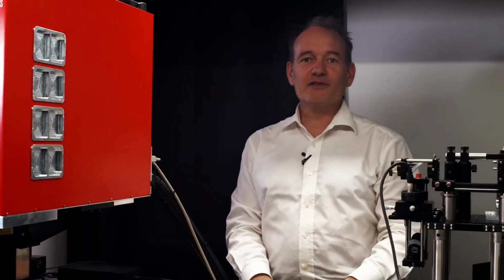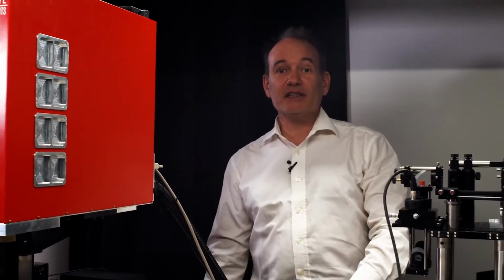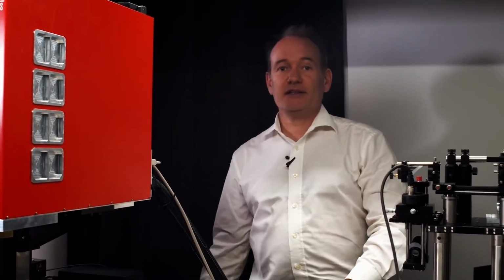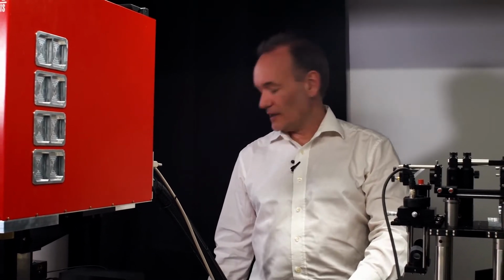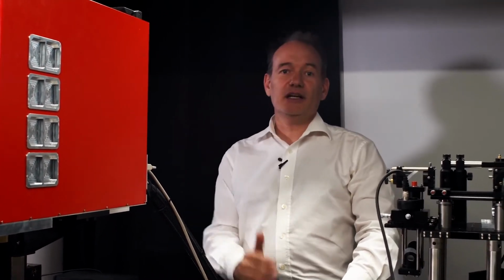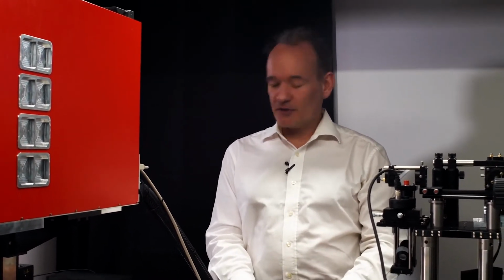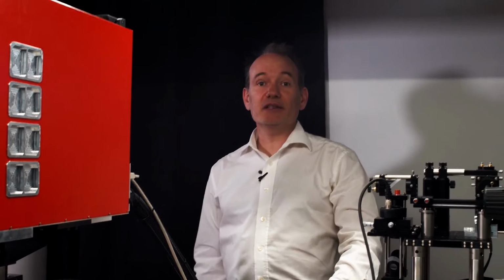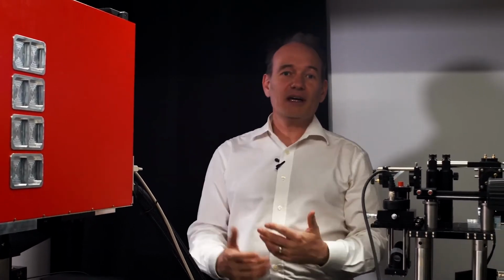That took us a few minutes to cable everything together. So we are starting up the PC here. The femtosecond laser is started up. The Galvo scanners are started up. And also the 8-channel LED light engine for the wide field epifluorescence imaging is also starting up. So it will take a few minutes until the system is ready, that everything is thermalized and ready to go.